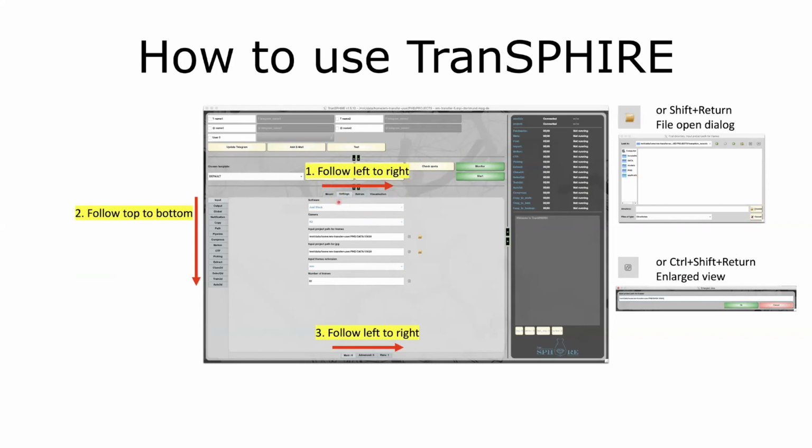Every time you switch between tabs here, we have a second tab row, which is going from top to bottom, which is what you're used to from, for example, EPU, I guess, which uses the same scheme. So we're going top to bottom here.